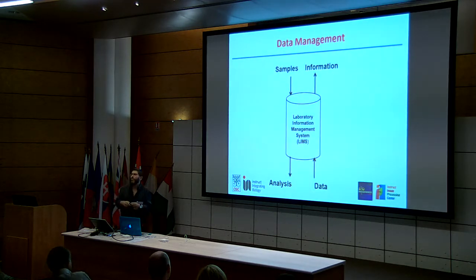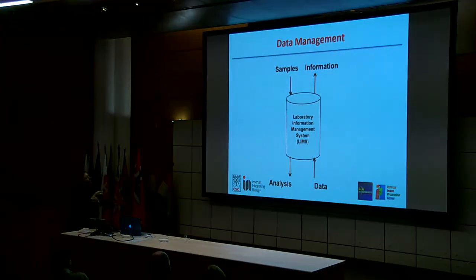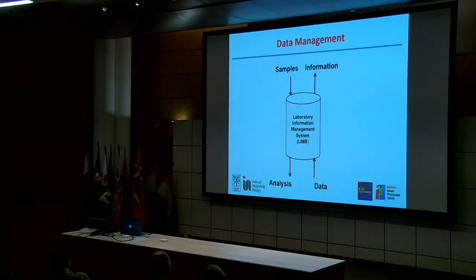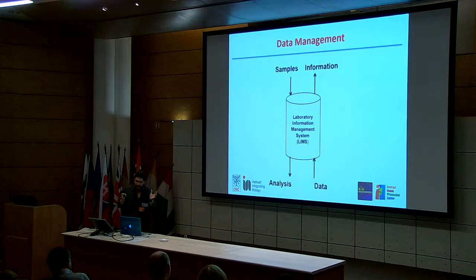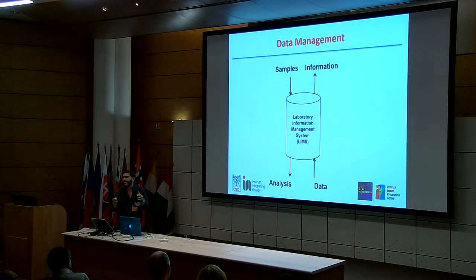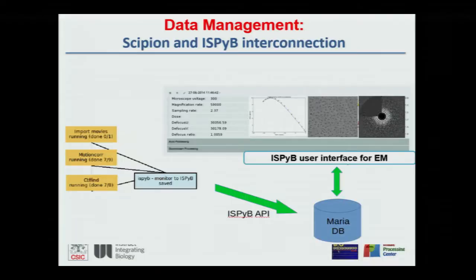Data management. What do I mean by data management, and what have we done for data management? When we talk about data management, the notion of laboratory information management systems comes into play. How do you care for hundreds or thousands of terabytes and really are able to follow what has been done with them, the preprocessing, things like that. We have addressed that issue by interfacing our software with one of the laboratory information management systems, ISPyB.